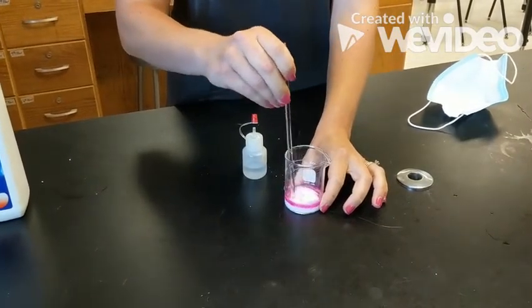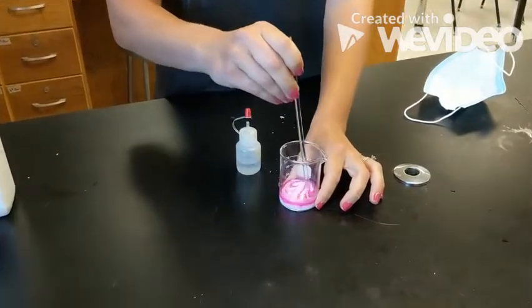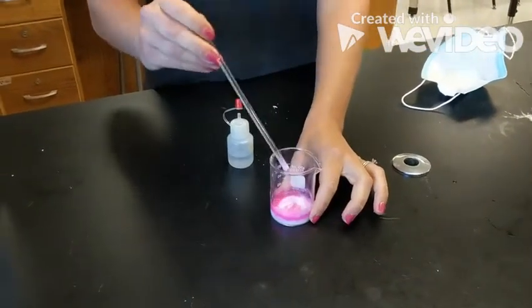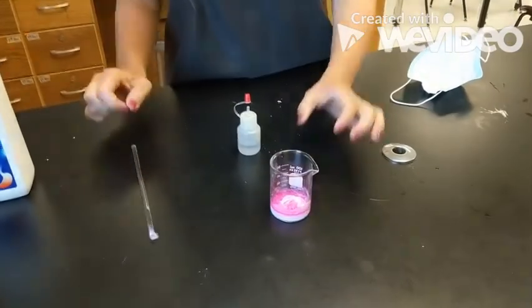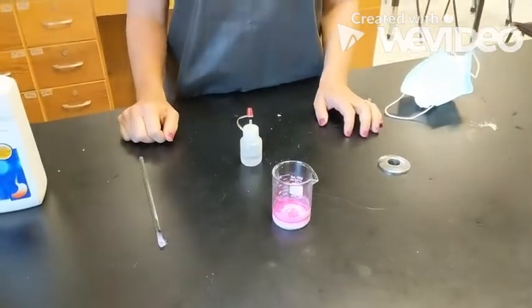You see there is a clear difference from when the 2 substances were separate at the beginning. Is this change a physical or a chemical change? What do you think?